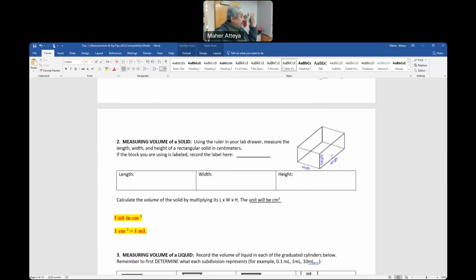You have to take a piece of wood in the back and measure all the dimensions and determine its volume, and write me the number. I have the key for each number here, representing how many cubic centimeters this value is. This is a rectangular block, not a cube. So I want to see the number here so I can compare it with the value I have.